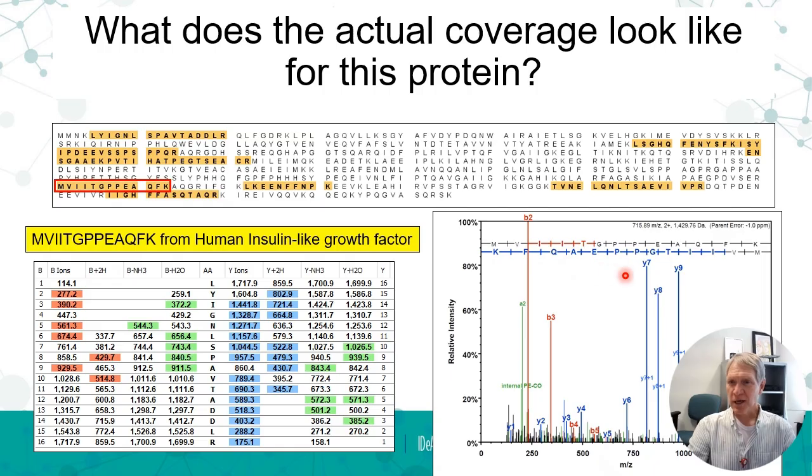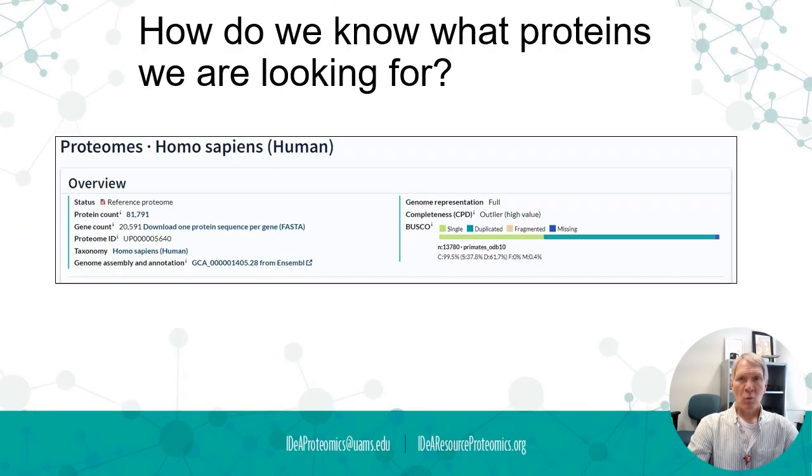You can see up here at the top how different fragment pieces, by subtracting, give us different pieces of information, whether this is a threonine and a glycine, whether those are prolines there, etc., from either the Y ions or the B ions. And so this is like a fingerprint. Each one of these peptides is going to have an MS2 signal, which is like a fingerprint that matches back to that specific peptide.